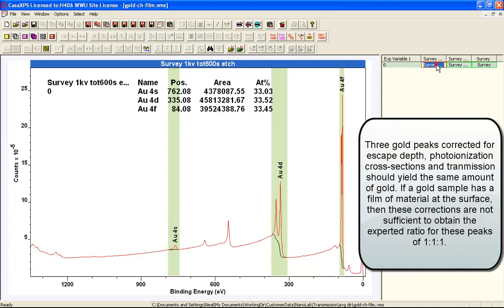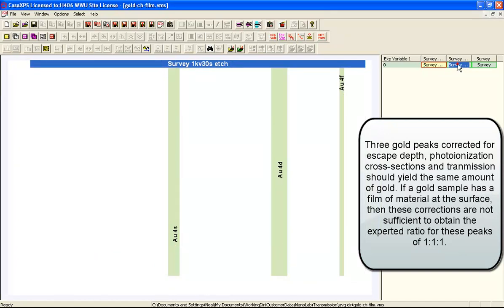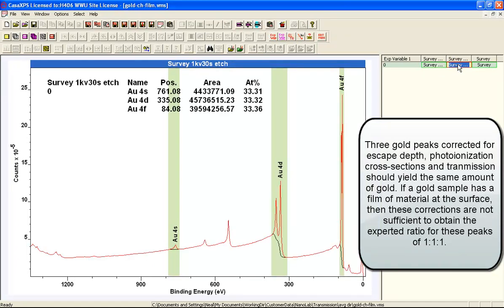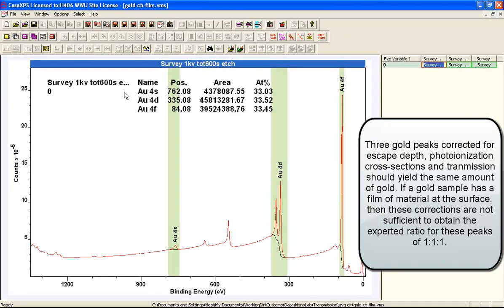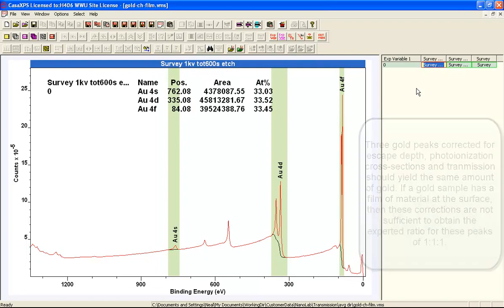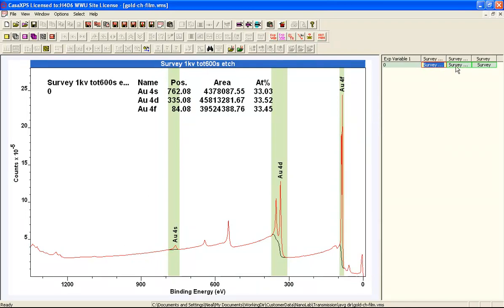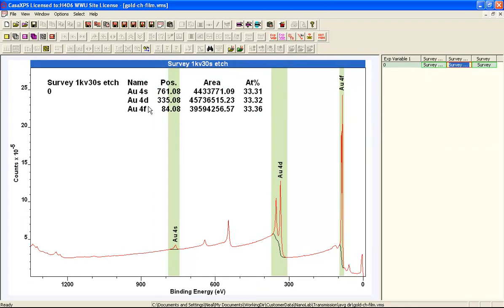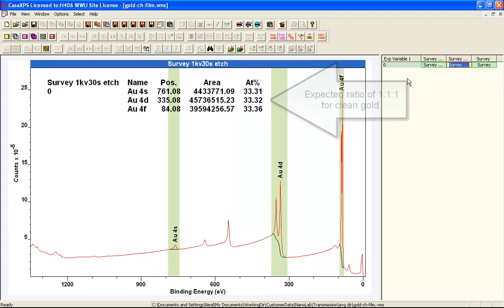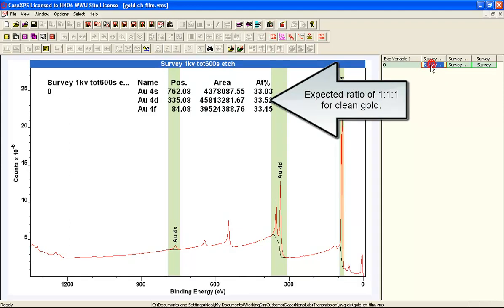These first two represent cleaned surfaces. The first one has been cleaned for 600 seconds with an ion beam, the second one only for 30 seconds. And you can see that the quantification from these three gold peaks are very similar between these clean gold surfaces.